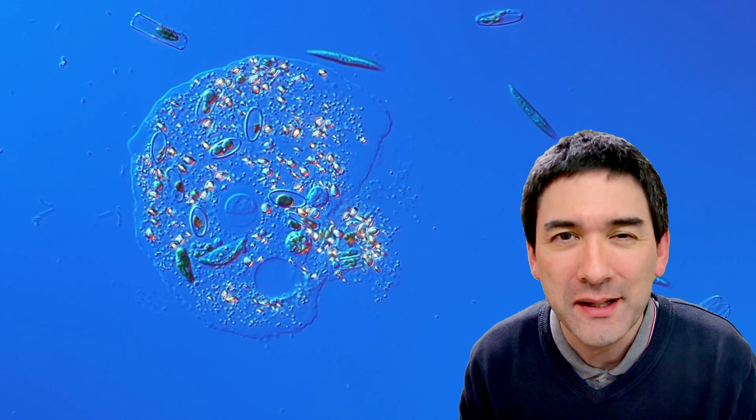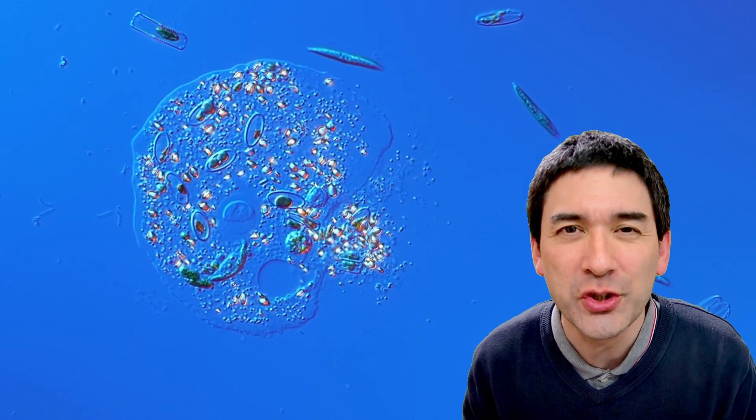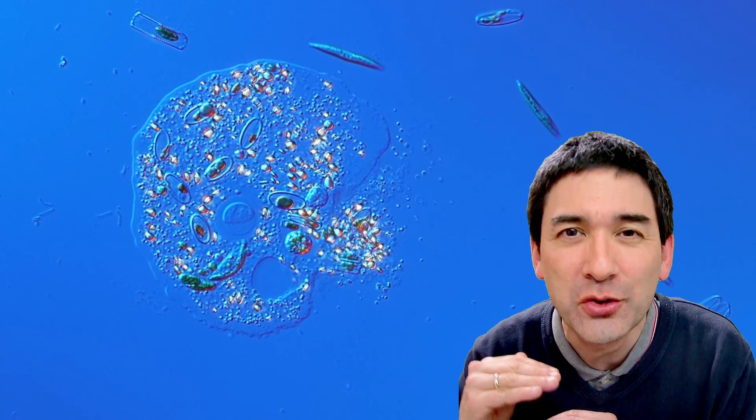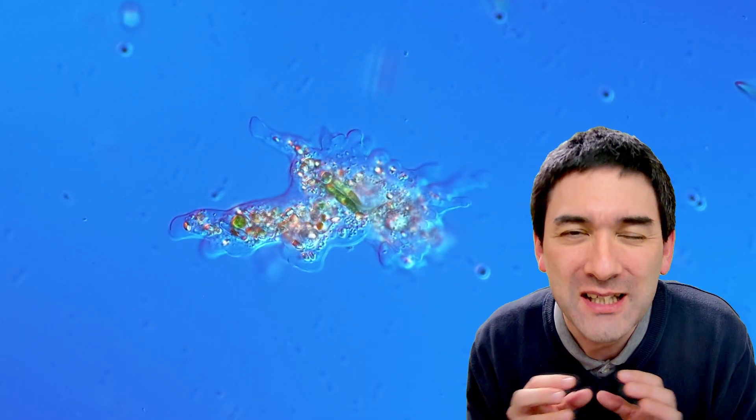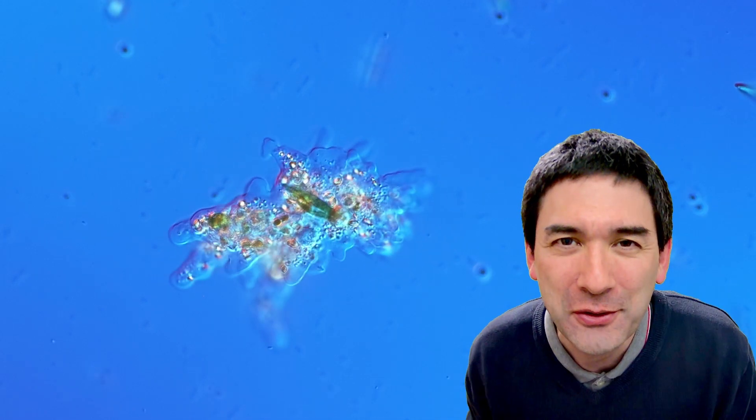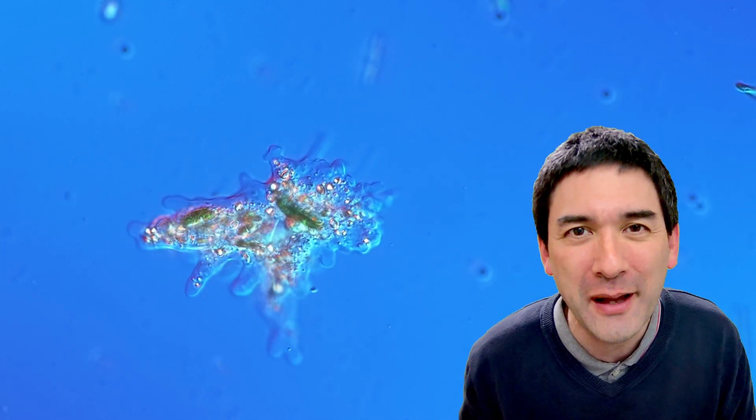So this here is an amoeba, it's a single-celled protist which is currently being squeezed to death under my microscope. The pressure is simply to hide the cell split open and spill all of its contents, and here is the amoeba still living around here happily.